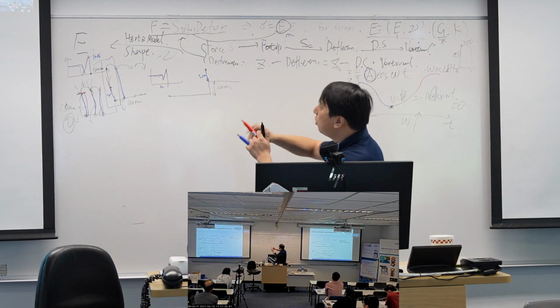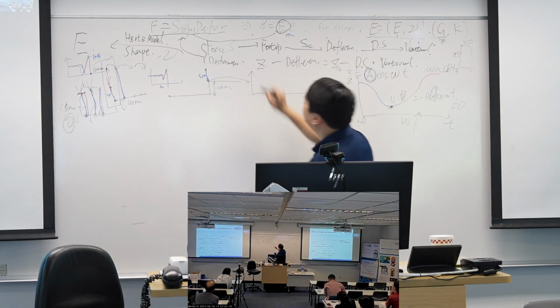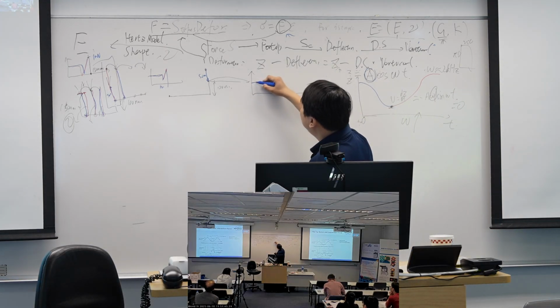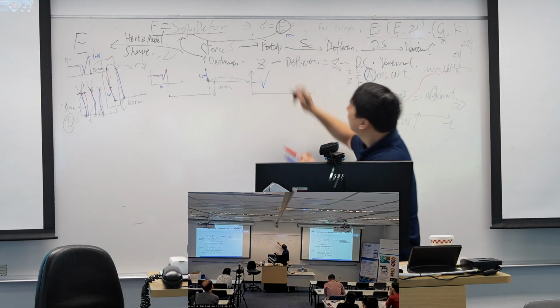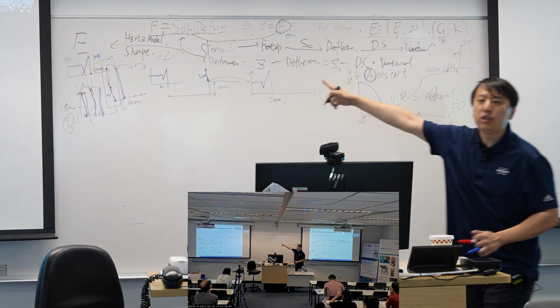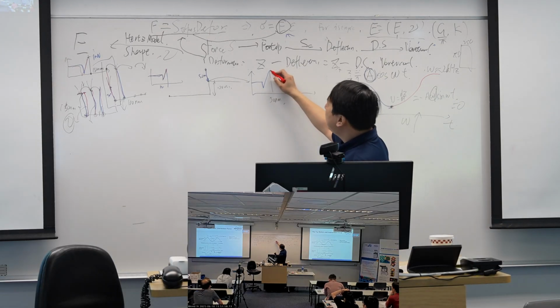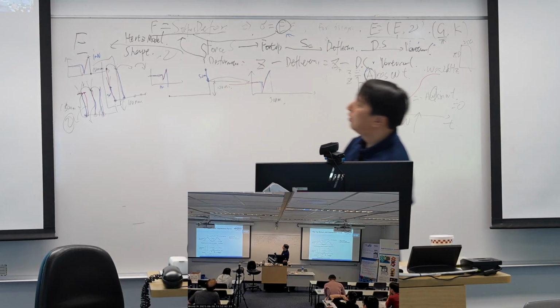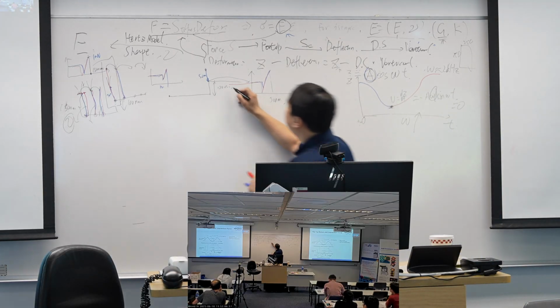So when I draw the force curve on this point, it will look like this. It moves down 50 nanometers. It will reach the step. It will reach the 1 nanonewton. And then the red curve needs to travel another 150 to here.